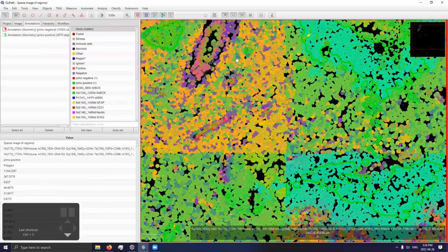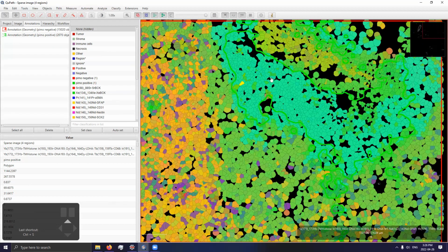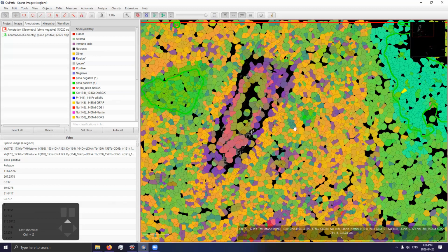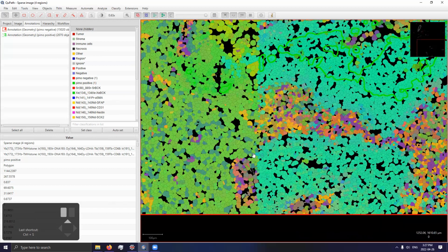It shows the heterogeneity in this tumor microenvironment. Any cell colored the exact same color as another cell means it's positive for the same set of markers. And we can actually see a little bit of similarities between the cells that are positive in this hypoxic area or cells adjacent to vasculature. We also see regions outside of the hypoxic areas that seem to also be positive for our hypoxia markers, which are, you know, equally as interesting.